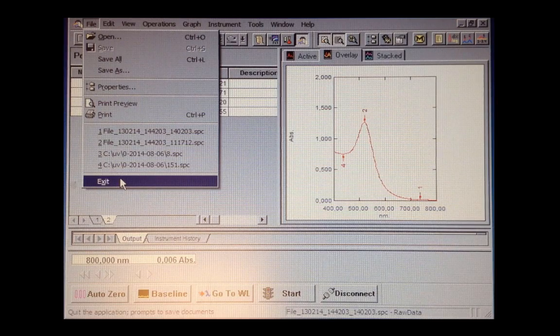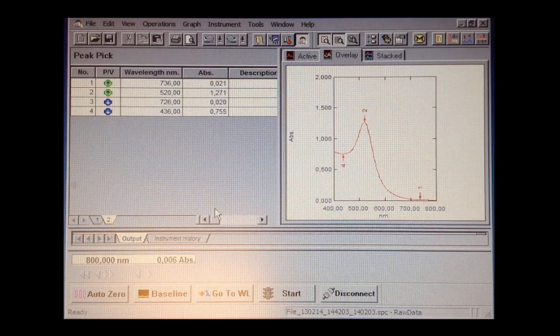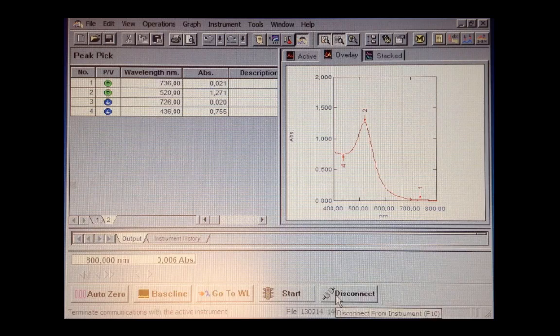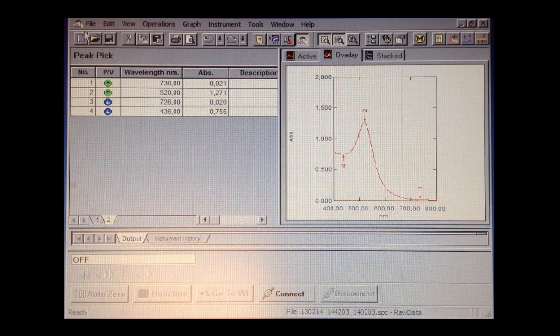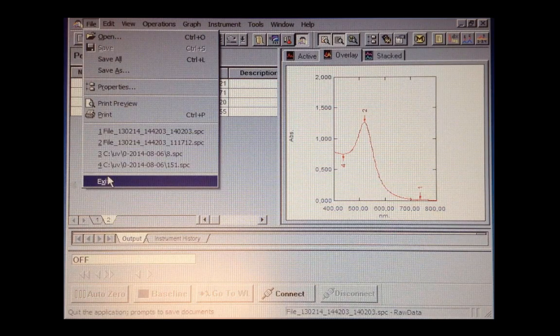If you want to end your experiment, just click exit. But before you do that, remember to disconnect the computer and the UV-Vis spectrometer, and then click exit.